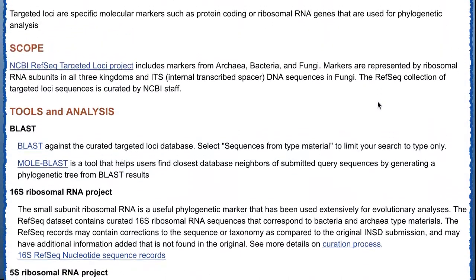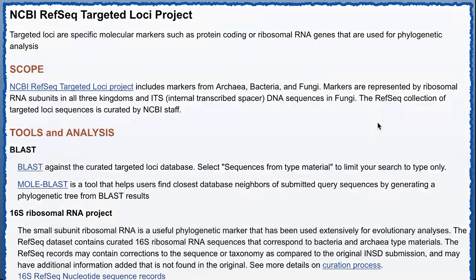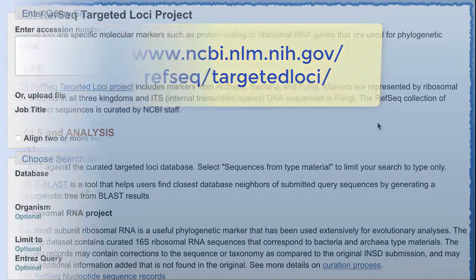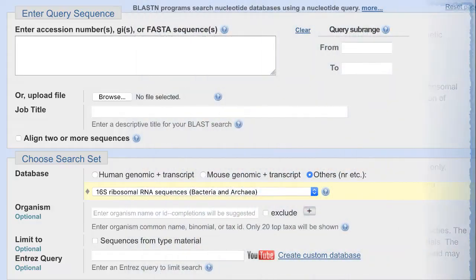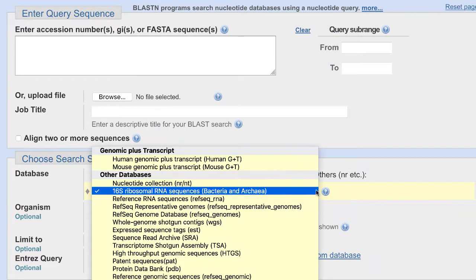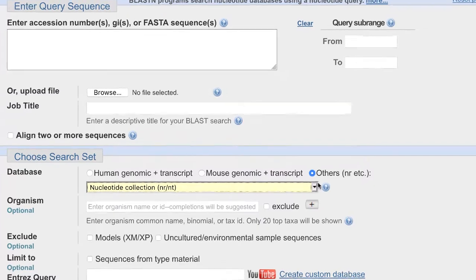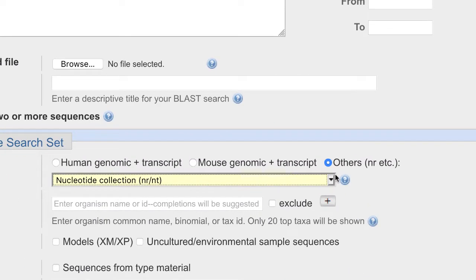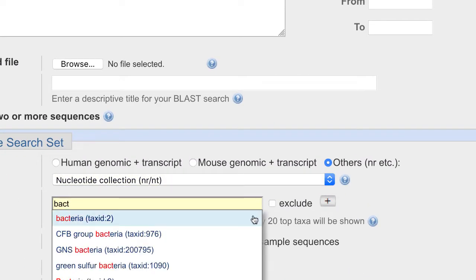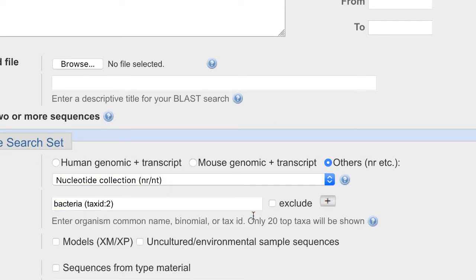To learn more, use the links in this Targeted Loci project page. If you do not find a good enough match in the 16S database, you can try searching NT, but be sure to limit at least to bacteria or archaea, and possibly to smaller taxonomic nodes.